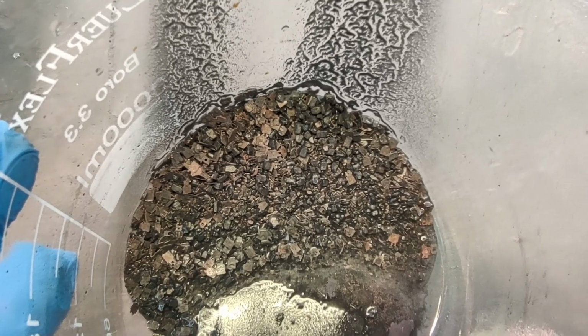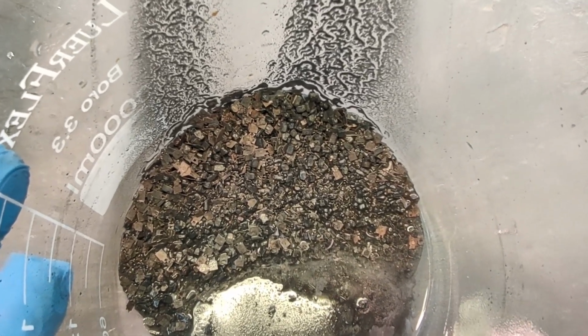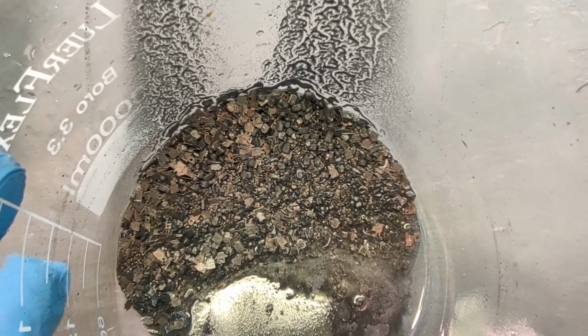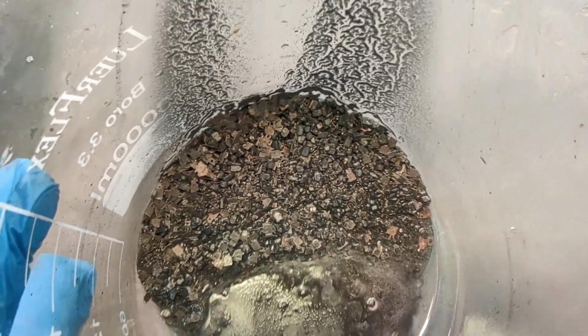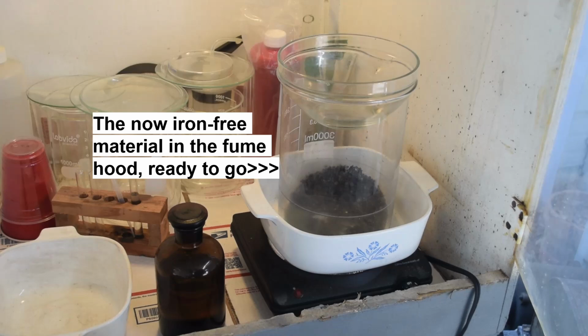Okay, let's get this in the fume hood and start dissolving away the other metals in here. It looks like we've got a fair amount of copper to get rid of. I know how to do that. All right, so that went pretty well. And I think it's time to go after the silver in this stuff.